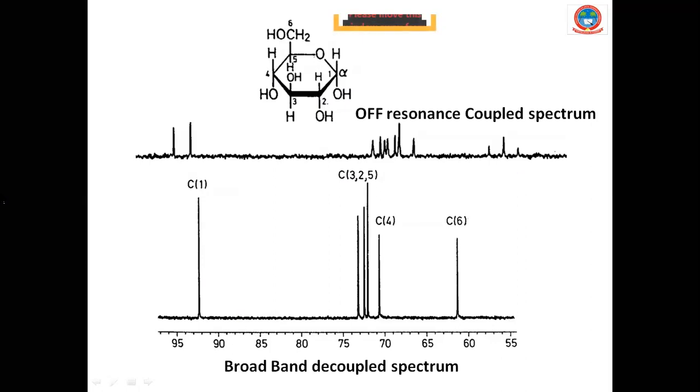Let us go for the next. You see the simplicity in the structure. Here we also got confused whether it is off resonance or totally coupled. Here it is totally decoupled. Totally decoupled is broadband decoupled. So this is a very simple spectrum. Now see, if you go for this molecule, how many signals are you expecting? First point. Yes, Aishwarya.